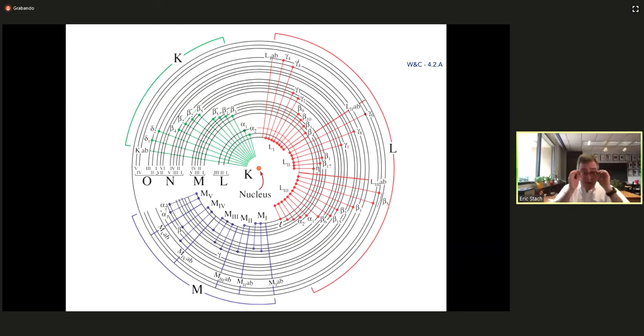But if instead what you're thinking is, I've got this soil sample and I'm really interested in what's happening at the outermost region for some reason, what you might do is take that sample, embed it in your resin, use the FIB or some other preparation technique to thin it down so that you had that local region, and then you could look at that either tomographically or just with standard transmission modes to try to characterize that.